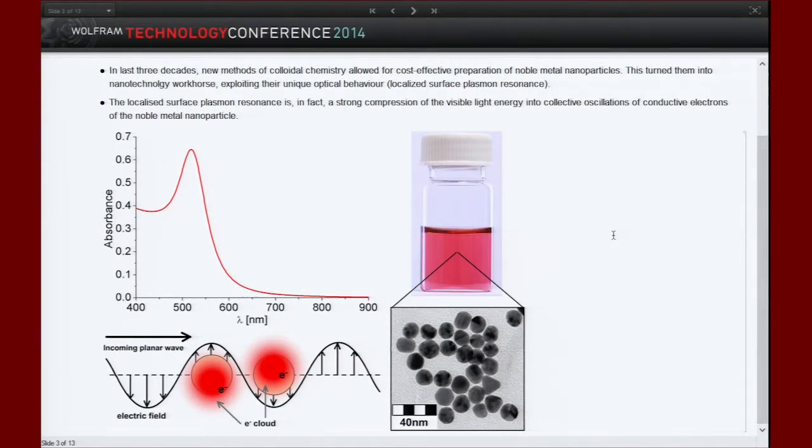Apart from what we would expect from gold, the image of the vial contains a dispersion of 20 nanometer gold nanoparticles, and the ruby color is the actual effect which has intrigued humans since ancient China, so that they thought that this kind of gold has some mystical healing properties, which weren't confirmed today.